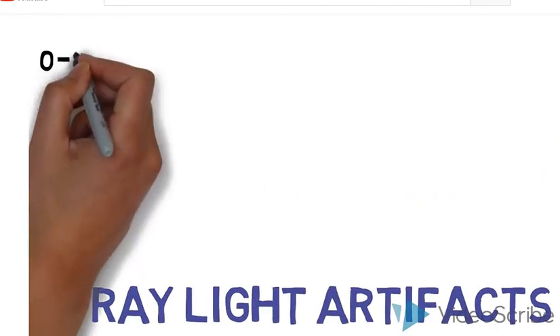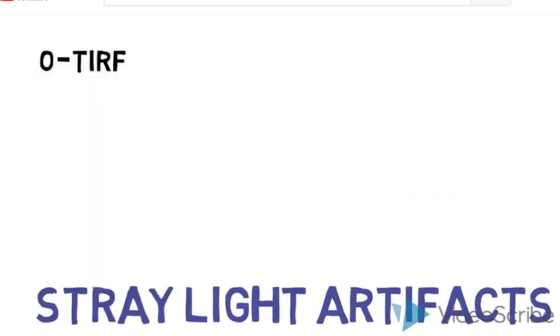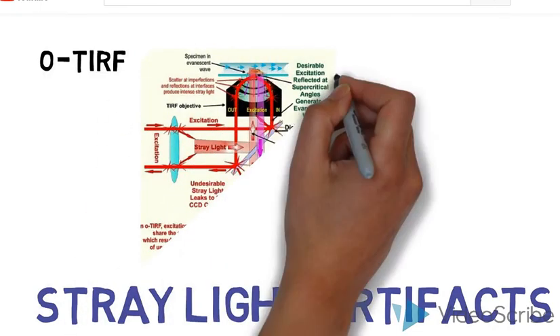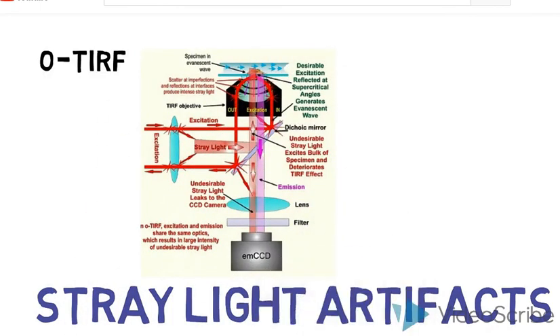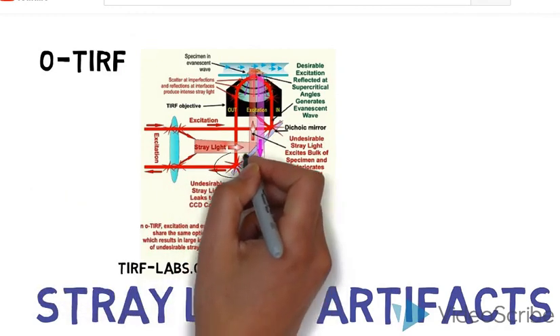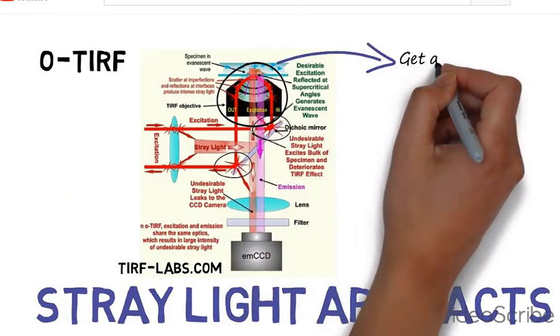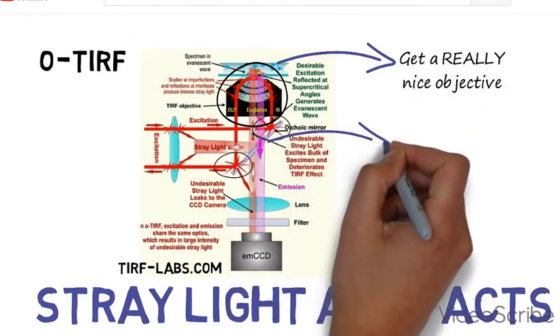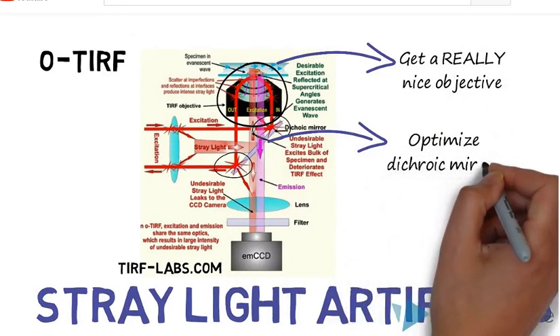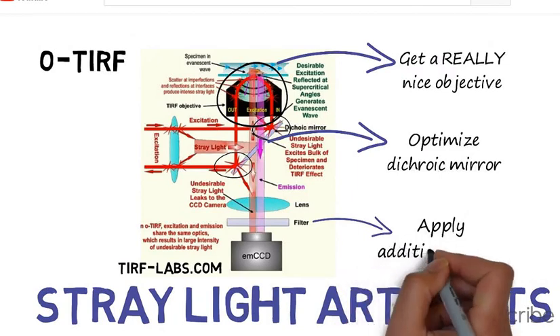O-TIRF, on the other hand, is more prone to stray light. The figure here identifies several sources in the O-TIRF setup that can contribute to significant stray light interference. This can be minimized by optimizing the optics, particularly the objective lens and the dichroic mirror. Additional filters can also help remove the excitation wavelength and scattering.